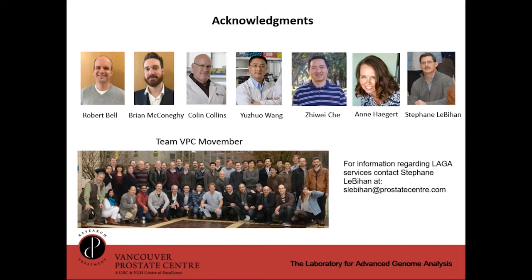That's probably the next thing I'll be doing coming up this month, with some renal clear cell kidney samples, and we're actually pretty excited to try that. But no, I haven't done too much with low pass yet.